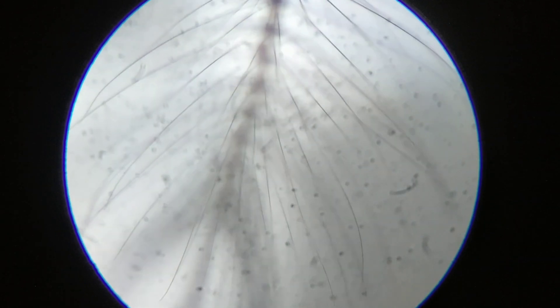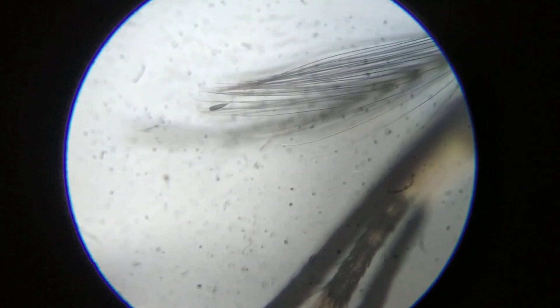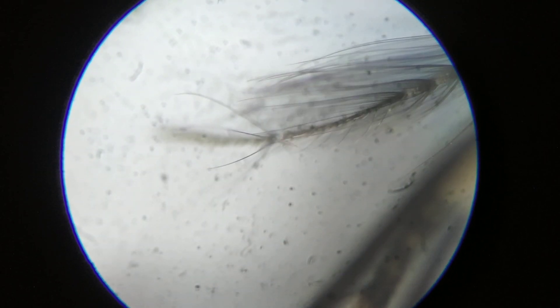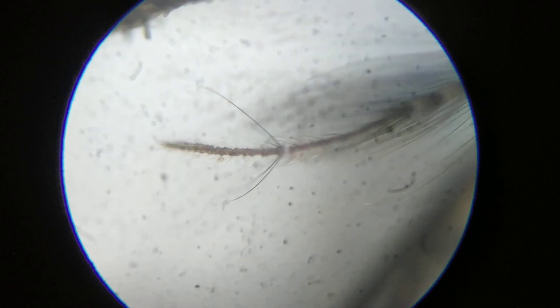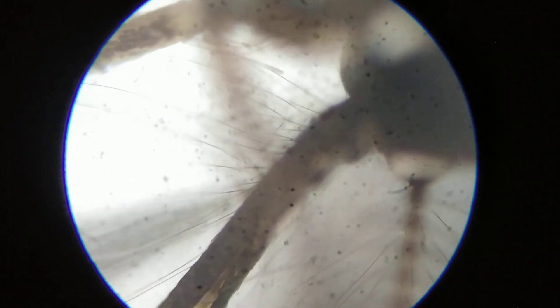It has two of them. One is this one, and the other is over here. There you can see the other one. This is one, and this is the other one, going all the way. It uses these feelers in order to detect the presence of the probable host nearby.